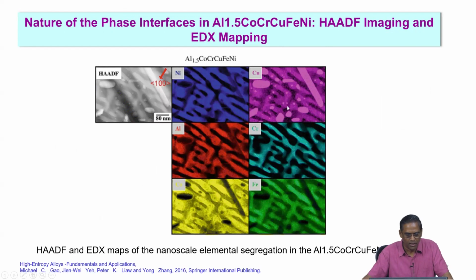And what is this you are seeing here? For example, this is an EDS map. What is the difference you are seeing? What kind of information will you get? Can you just identify what the differences are? It all looks similar in one go, but if you have a close look at it, you will find very interesting features to be identified.